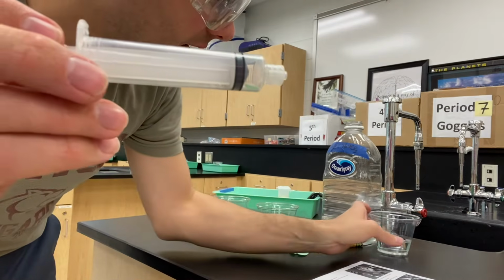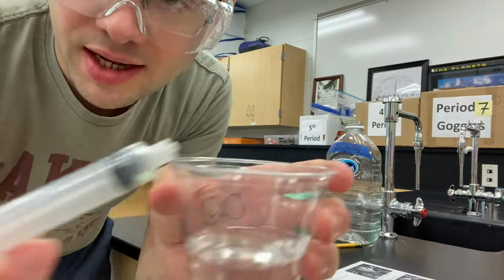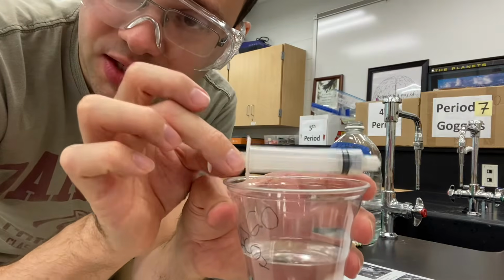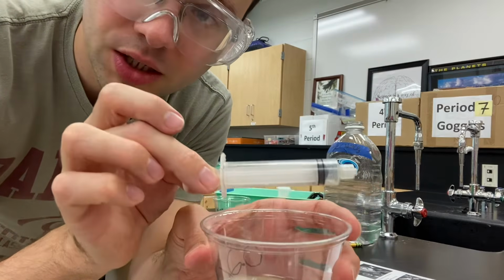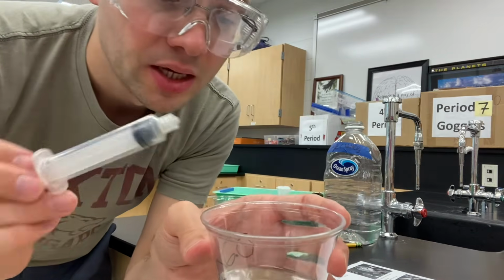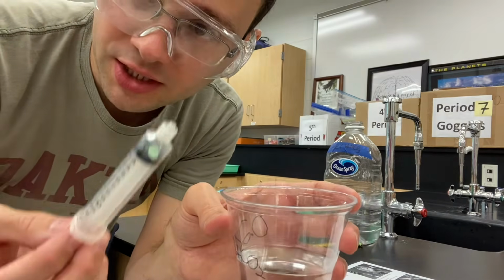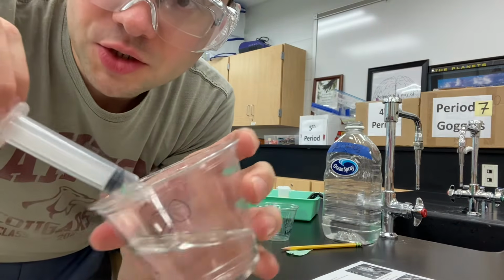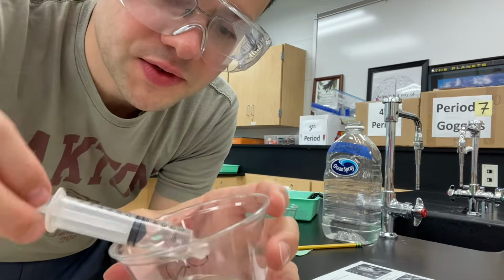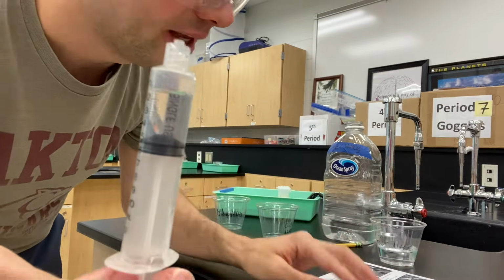And then you're gonna take your sodium bicarbonate solution, and I would recommend resting your syringes adjacent or next to the cup that they are gonna be used for, because not all 3 cups will be the same. That way you're not mixing and matching which cup you're using with each syringe. And you are going to suck up about 4 milliliters of bicarbonate solution.